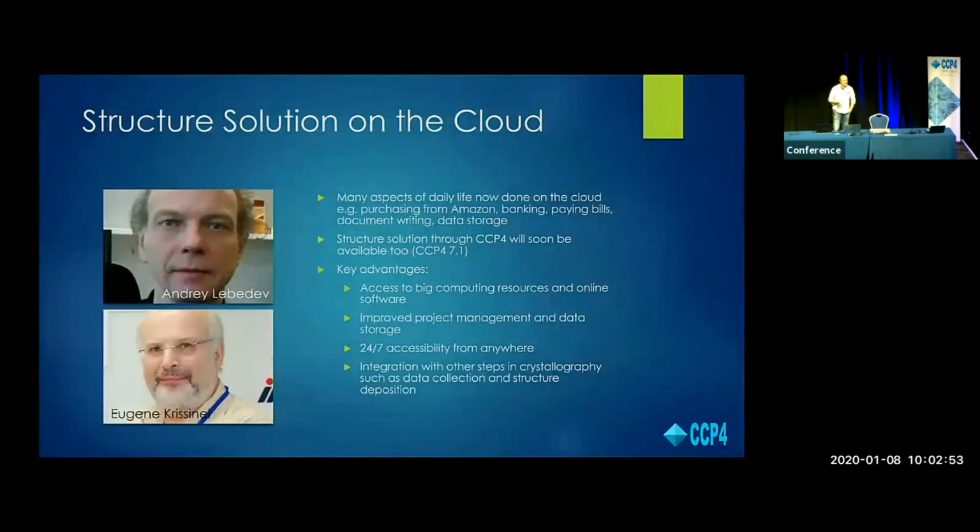And it can also integrate well with other steps in the crystallographic pipeline, such as data collection at the synchrotron, where you can pick up your images directly from the various data stores that the synchrotrons might have, right through to deposition. It includes a deposition task where you can set up things to deposit directly in the PDB.